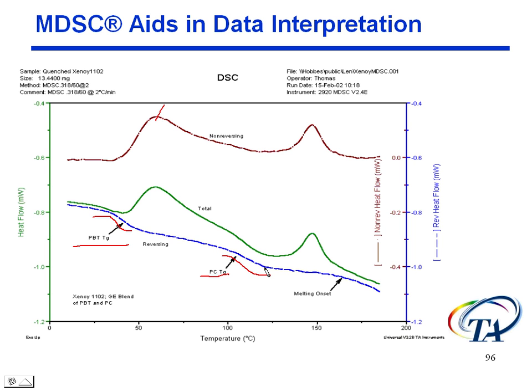However, when we go through this first glass transition, of the PBT, it gives us additional mobility. But we still have the polycarbonate that's below its Tg, so that's still limiting our mobility. So some of the material crystallizes here, and as we go through this glass transition, additional material crystallizes. And that's what we see there. Then in the melt region, which we don't have blown up on this curve, we see the reorganization and crystal perfection that we showed on the PET sample.